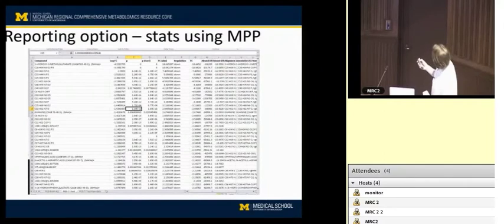We will also report a fold change analysis with p-values, corrected for multiple comparisons. Again, you're looking at knowns and unknowns here. So this is definitely something where at this point you're probably going to come back to us and say, what can we do about this, because most of our highly significant features are unknowns? So how do we deal with that? We'll talk about different strategies for that in a moment.